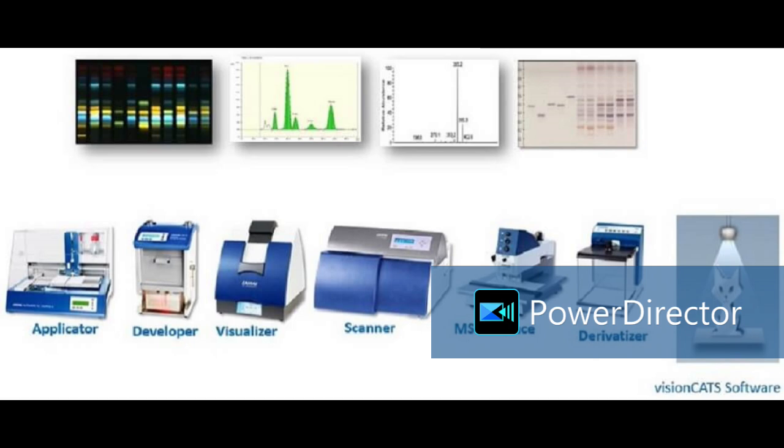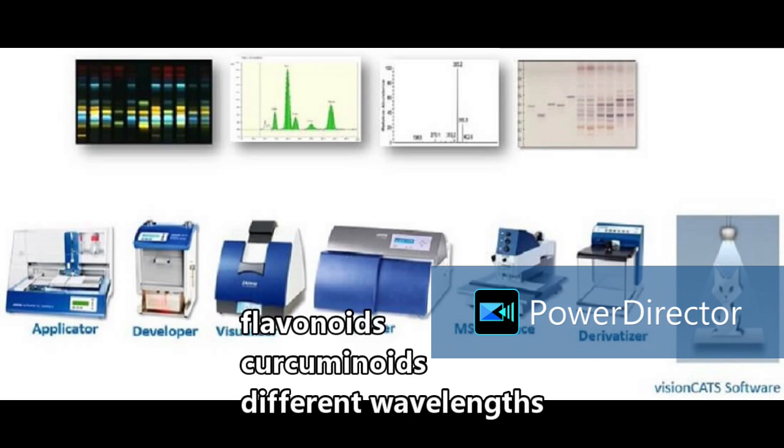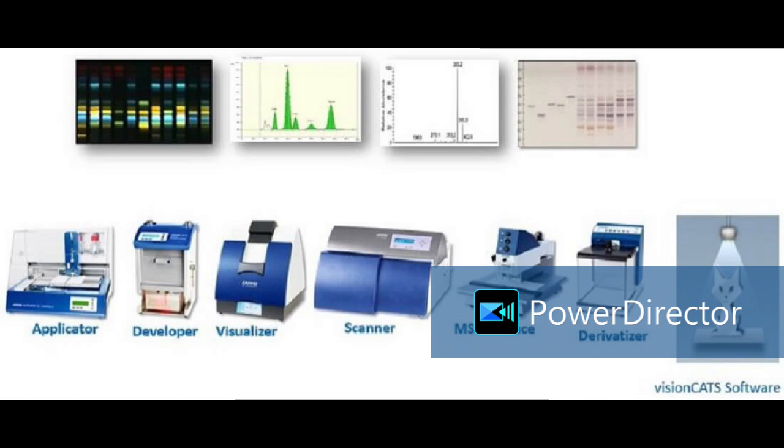Yes ma'am, because we have to observe the plate under 3 different illuminations, because some molecules are visible in white light, some molecules are visible in UV light, some molecules show fluorescent properties, like in plant analysis flavonoids are fluorescent in nature. So flavonoids we have to analyze in fluorescent wavelength. Then some curcuminoids etc. or colorful bands, dyes, inks, we have to capture under white light. They are visible in white light.